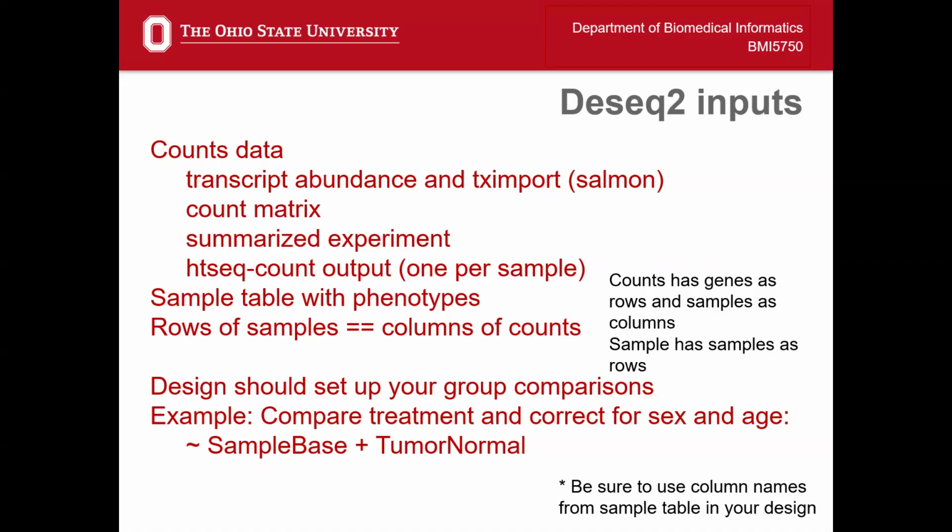You could also include covariates in this setup. Do you need to correct for sex or age or some important clinical measure that was measured with this data? I do statistics for a PI that studies lung cancer, and when I do the statistical test, he says, I know these measures, they also need to be included in the statistical test because they are important.